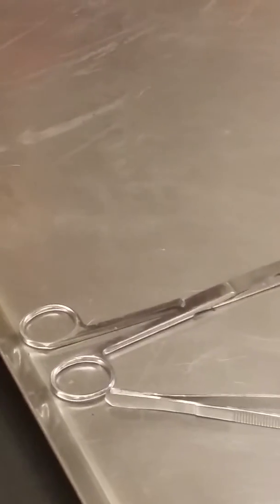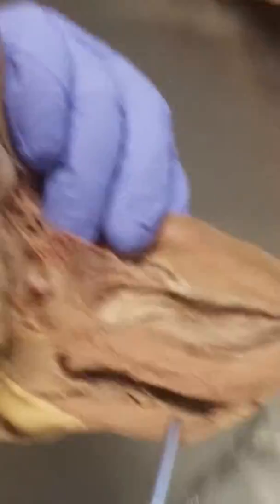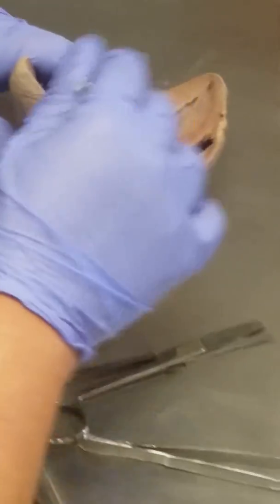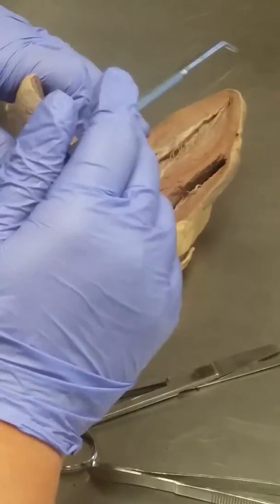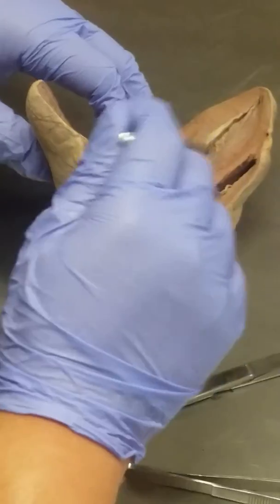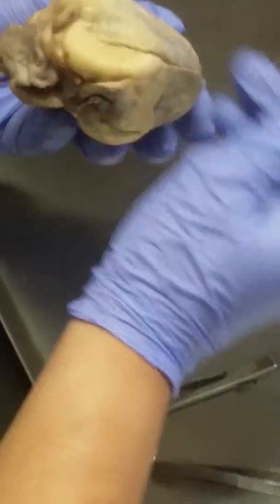Notice how the left ventricle is thicker than the right ventricle here. Left ventricle, thicker walls than the right ventricle. See that? Why do you guys think that is? Why is it that the left ventricle should have thicker walls than the right? It pumps blood to the body. The left has to have thicker walls so it can produce greater force to push the blood out to the rest of the body. The right ventricle just pushes it to the lungs, and the lungs are right next to it, right? That's why. And yep, this tells me this is anterior.